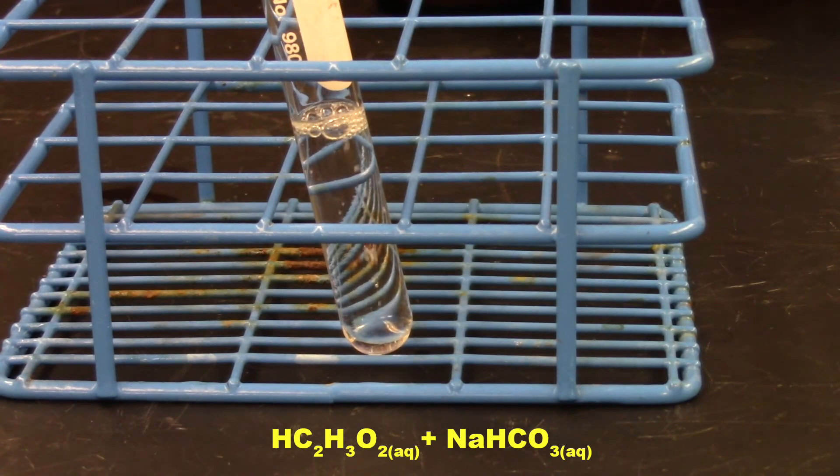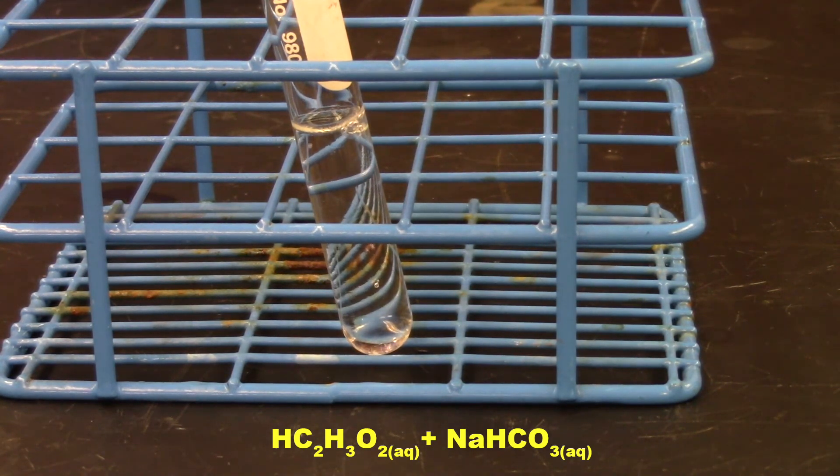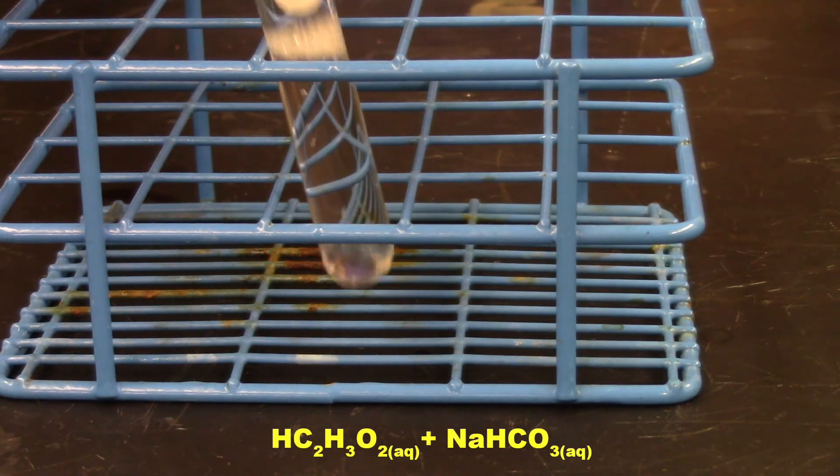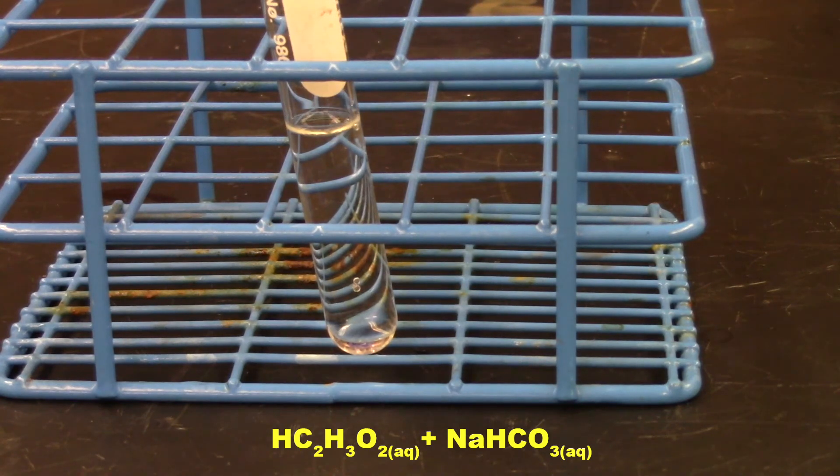See it? You see it? Bubble formation. Let's see if we can get some more. So when you add sodium bicarbonate to acetic acid or vinegar, you get lots of bubbles. And those bubbles are CO2. And it's kind of still going. You can kind of still see it. So that's pretty cool. Bubble formation.